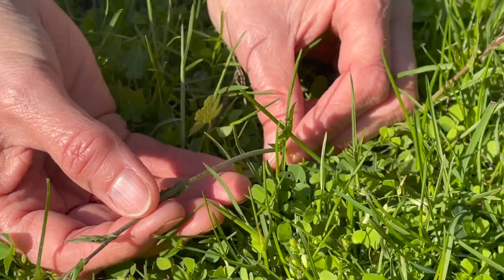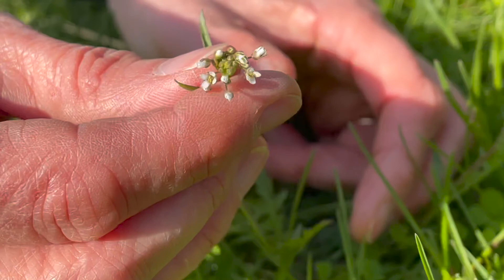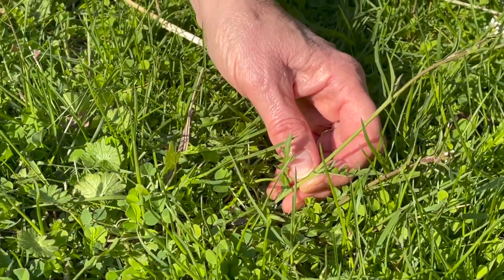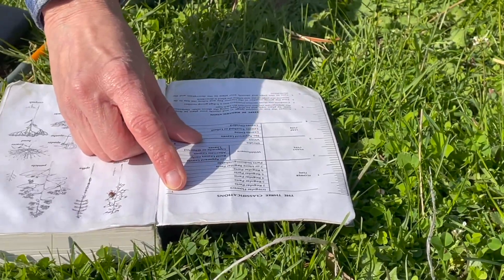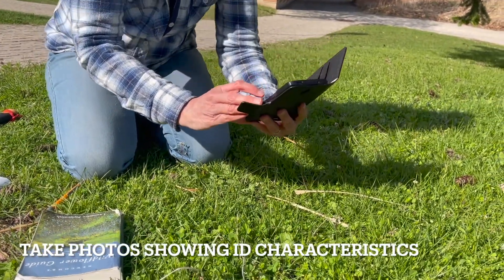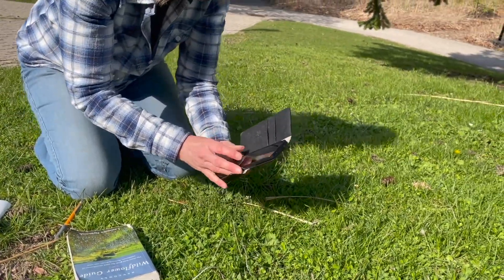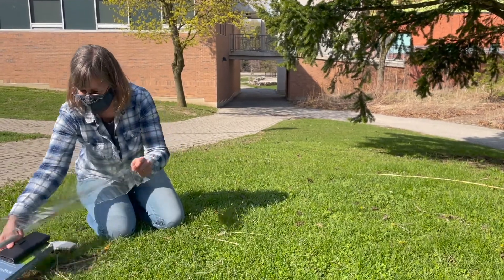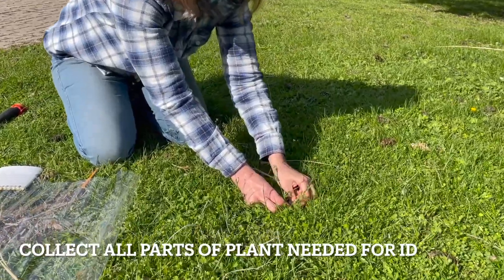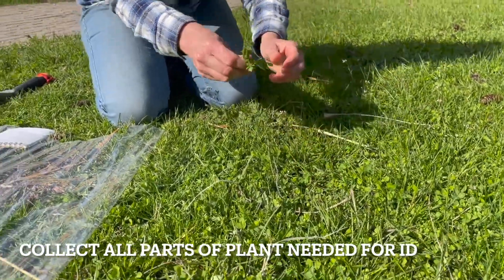We are using Newcomb's Wildflower Guide. You can see this first plant specimen has four flower parts, alternate leaf arrangements, and divided leaves. It is always a good idea to take clear, good quality pictures of the plant and plant parts showing the characteristics needed for identification. Unroll one end of the plastic roll and collect the plant parts that show the features needed for identification – flower type, leaf arrangement, leaf type, etc.